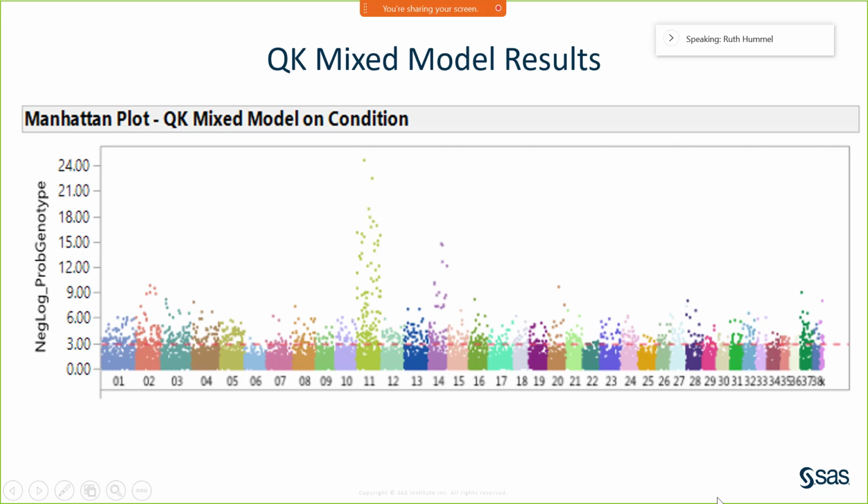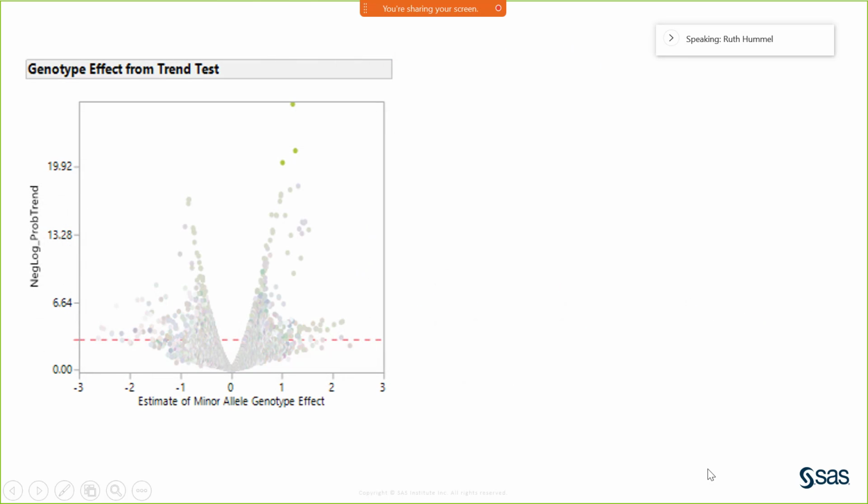So this is called a Manhattan plot. We're kind of scanning the skyline and looking for the really tall buildings. That's where we see a lot of effect, or high, really important effect. Here are 3 of our most important, most highly significant and kind of large effect SNPs.